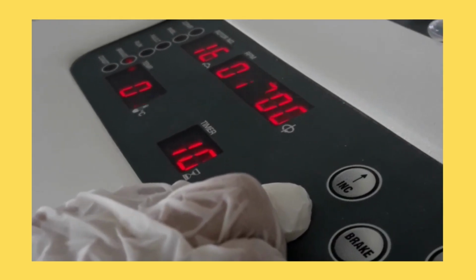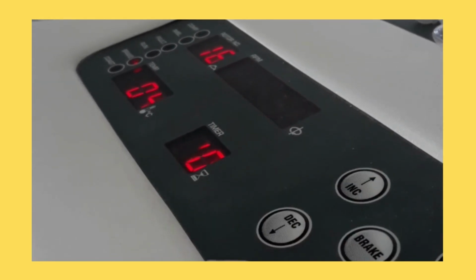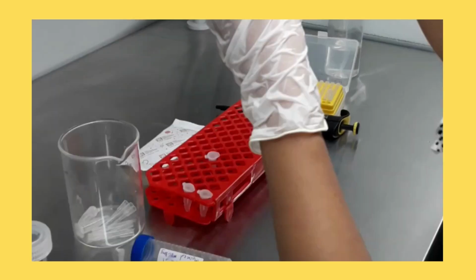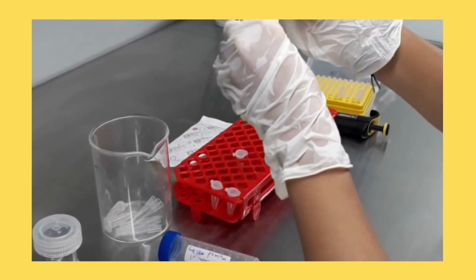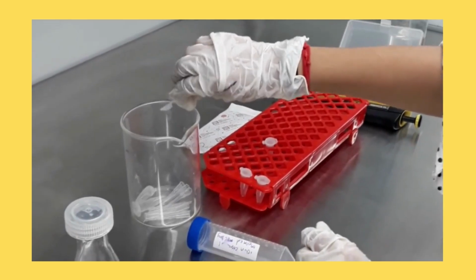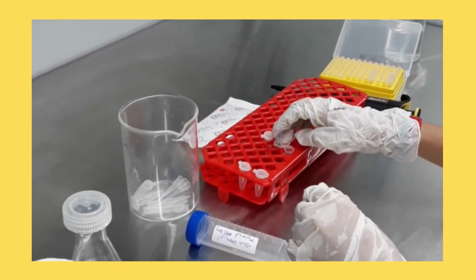Centrifuge at 7500 rpm for 10 minutes at 4 degrees Celsius. Discard the supernatant and add 300 microliters of chilled 100% ethanol.